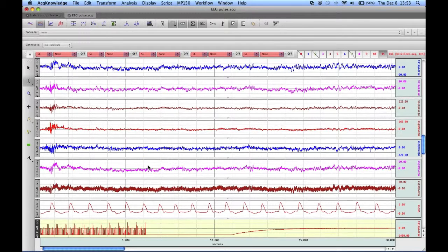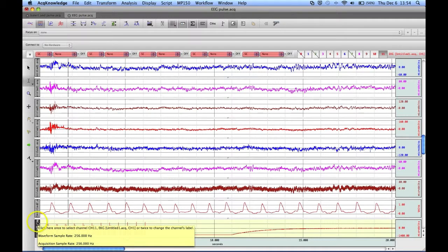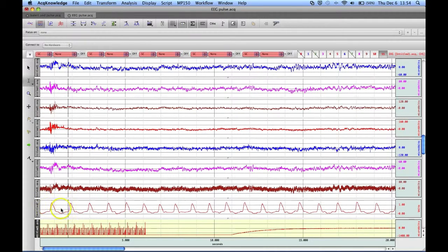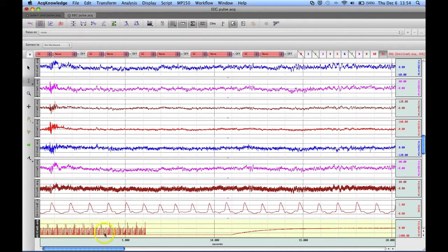If we take a closer look at the merged data file, we'll again see all of our BeAlert data, the merged pulse data from the MP150, and here you'll see the EKG channel from the BeAlert headset that we used for synchronization. Here, you'll see the synchronization pulse that was sent from the MP150 to the BeAlert headset. When the graphs were merged, the system took the acquired data from the pulse channel, found where this synchronization pulse started, lined them up, and removed any data from the MP150 that had come in before this synchronization pulse began. These two files are now linked based on this synchronization pulse.